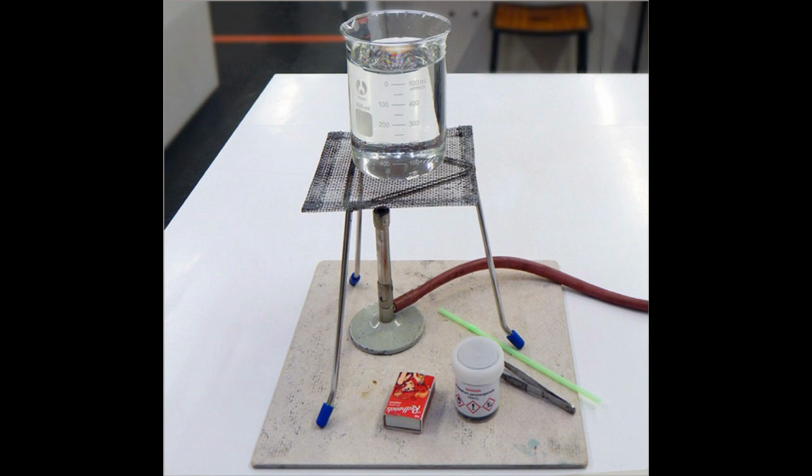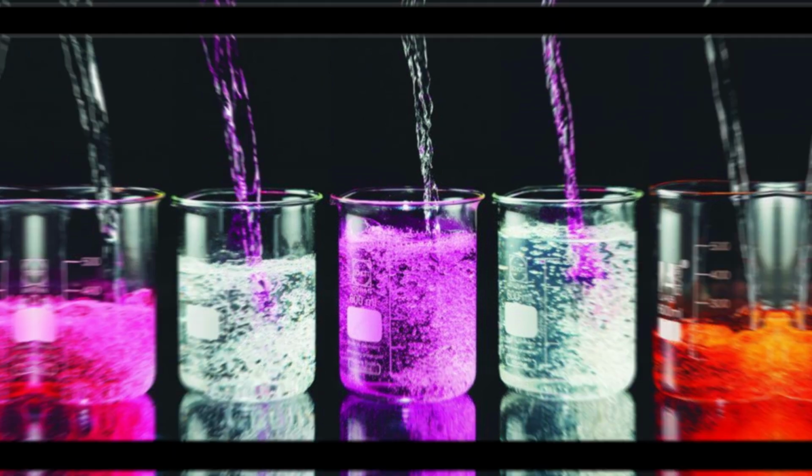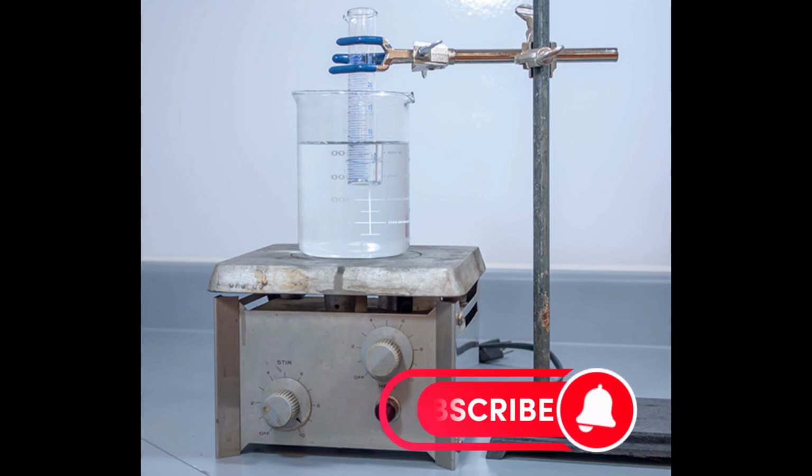Measuring rough volumes. While beakers provide approximate volume measurements based on markings on the side, they are not as precise as graduated cylinders or volumetric glassware. Beakers are suitable for situations where precise measurements are not critical. Easy pouring. The spout or beak of a beaker makes it easier to pour liquids without spillage. The design allows for controlled pouring and minimizes the risk of splashing.